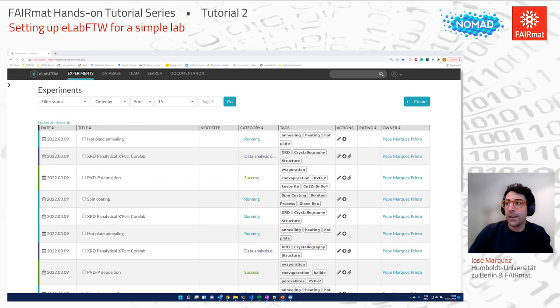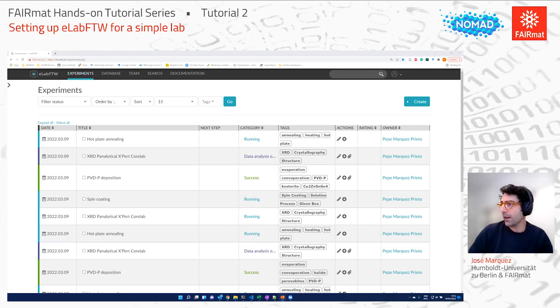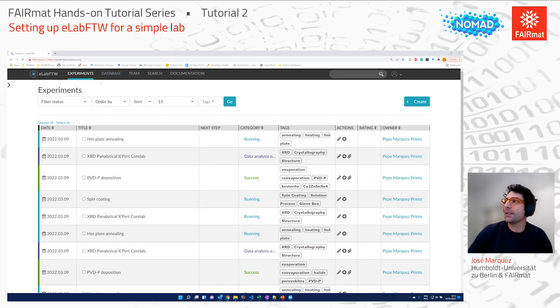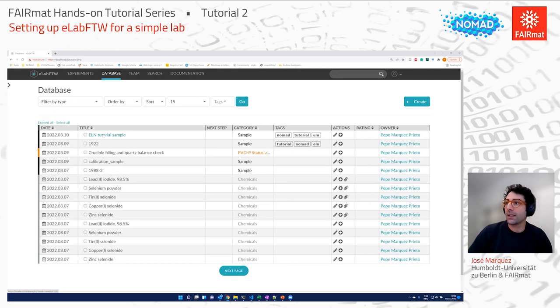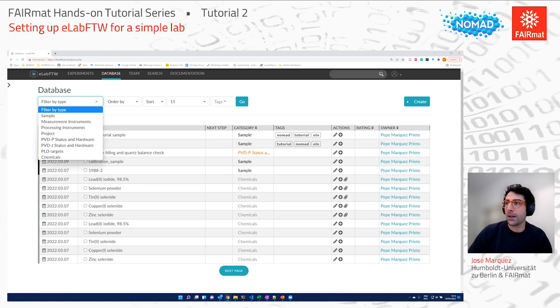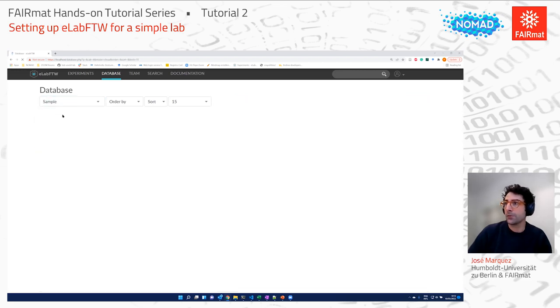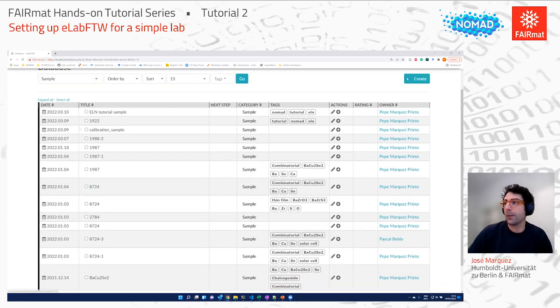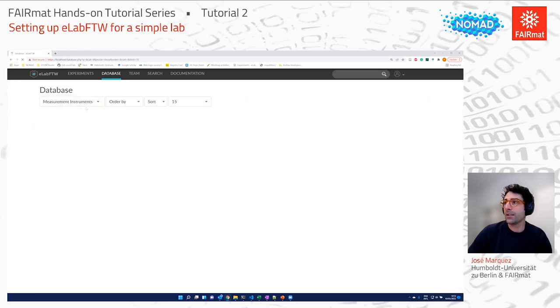We now have an already installed instance of eLabFTW where I've already defined all these templates for the techniques I listed, and also my database. We are in the Experiments tab — this is the list of experiments I've created, showing the title, some tags, the category, and the owner. If we go to the Database tab, the database items I've defined in my lab are listed there, and we can filter them by category. For example, I've defined samples, and here are the samples I have in my logbook.